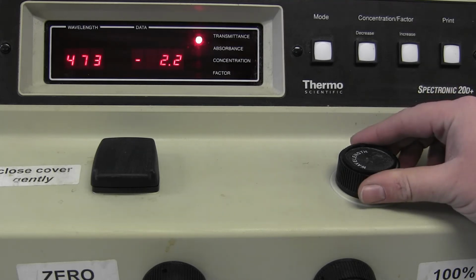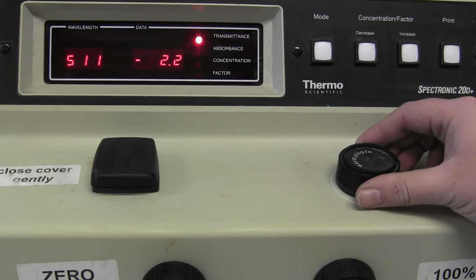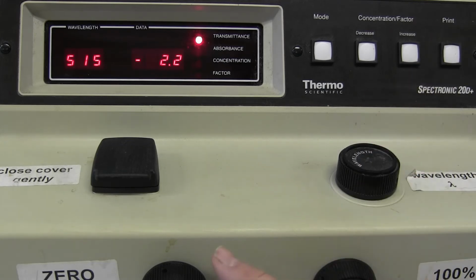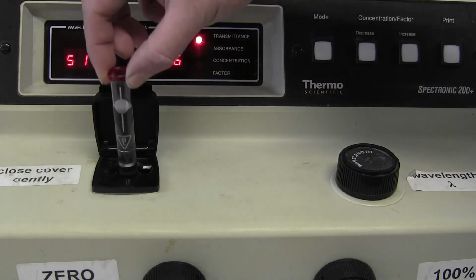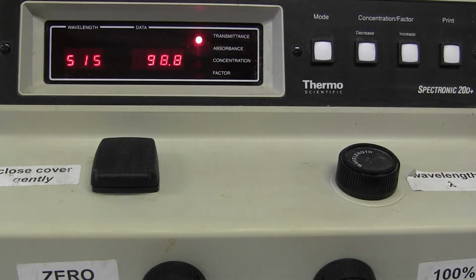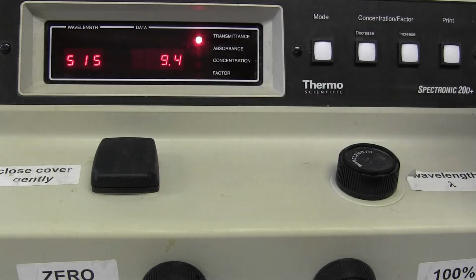You can first dial the wavelength to 515 nanometers. Adjust using the left-hand knob to a percent transmittance of 0. And then, placing ethanol in the sample chamber, you can adjust the percent transmittance to 100% using the right-hand knob. Now, this spectrophotometer is calibrated at 515 nanometers.